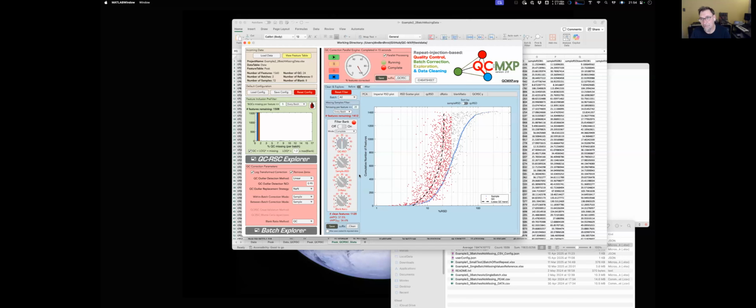So what I've done is I've done that automatically in the background. If you do a log transformation, it will automatically subtract. If you don't do a log transformation, then the normalization will be a divide. But nobody needs to know that. They just need to know that it works, I suppose.